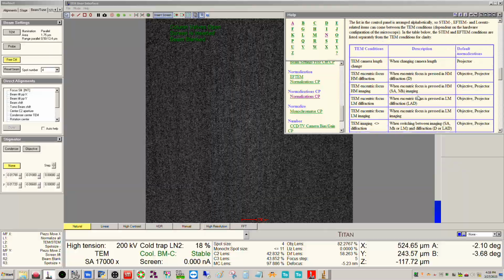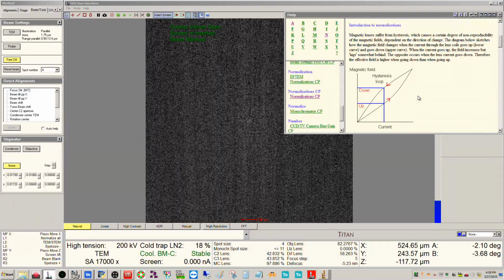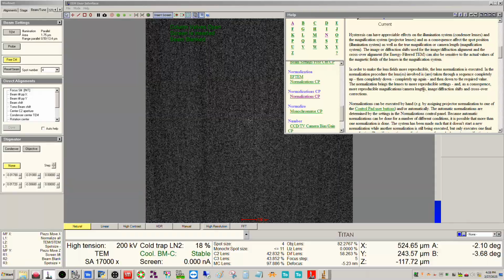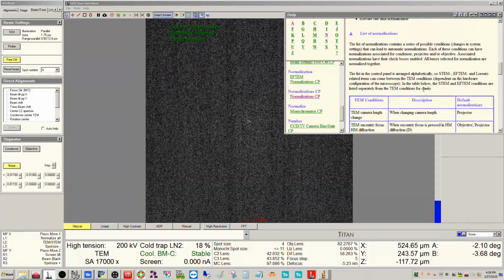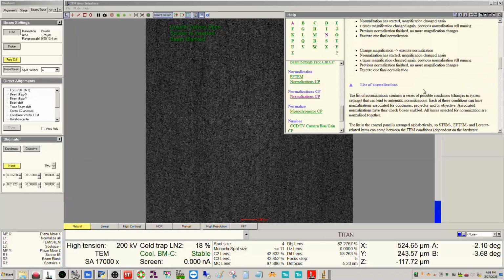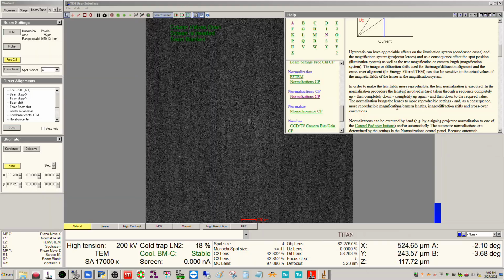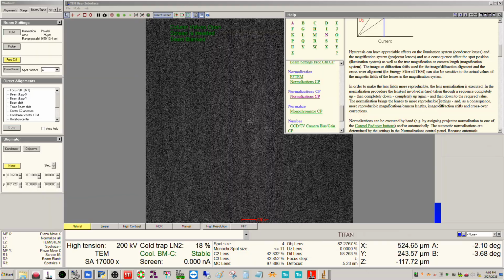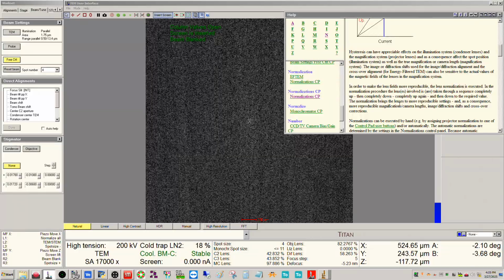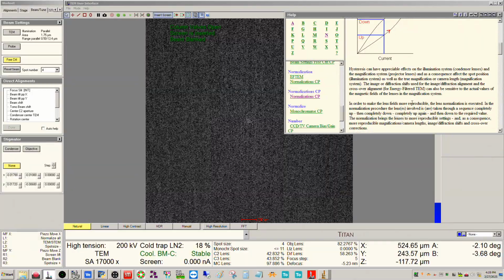So does it show this here? It doesn't show this. So basically what it does here is it goes through a process. I wanted to show this here. Okay, so here's what it does. It goes through a sequence: completely up, then completely down, then up again, and then down to the required value. So basically it goes through this hysteresis loop, sounds like almost twice.